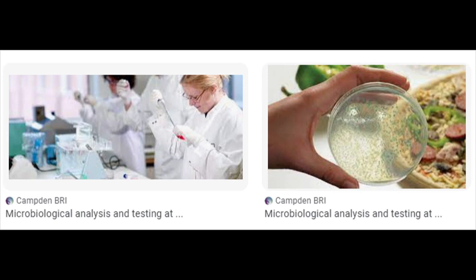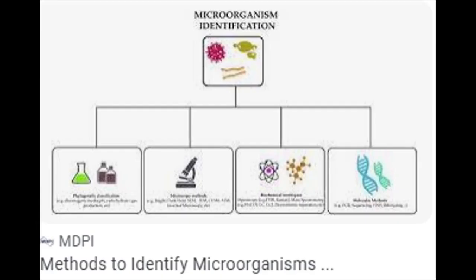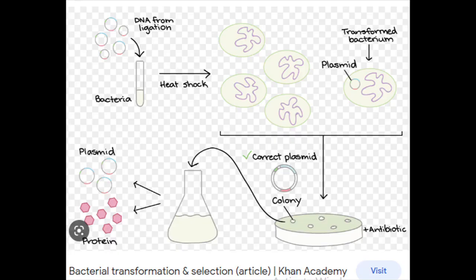A sample is filtered through the hydrophobic grid membrane filter, which is divided by a hydrophobic grid into a number, normally 1600, of small cells or growth compartments. After incubation of the filter on an appropriate medium, each of these cells is scored for growth or no growth. This can be done either manually or automatically, and the count in the original sample determined as equivalent to a single dilution MPN using 1600 tubes.